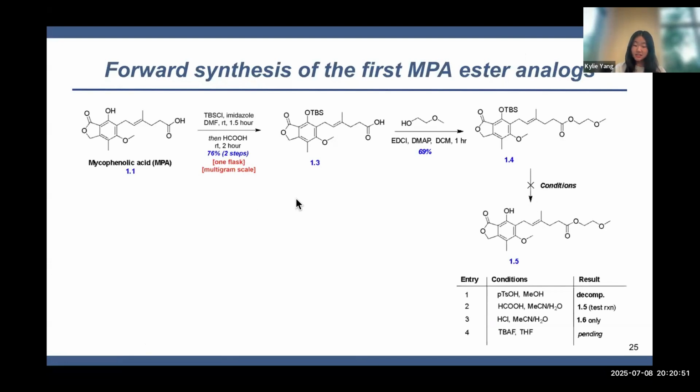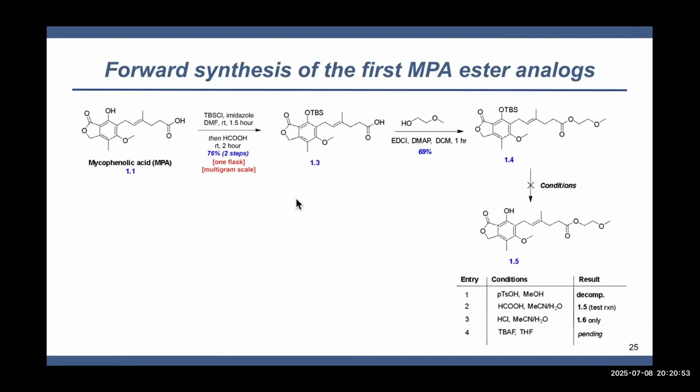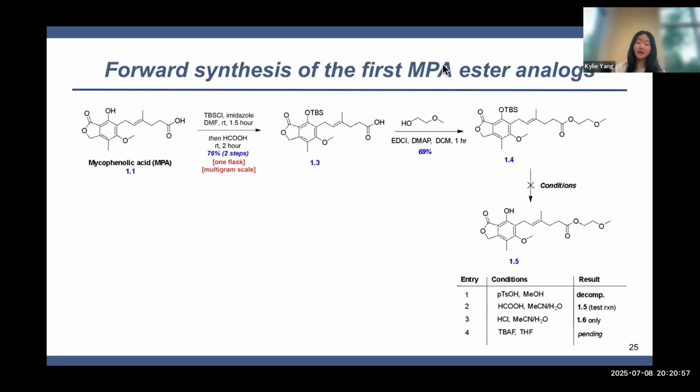However, the reaction was inefficient, requiring several hours of stirring, and we did not obtain enough product to quantify yield by NMR. And when hydrochloric acid was used, we discovered a highly polar product, as shown by TLC. We hypothesized that the strong acid had popped open the lactone ring of the molecule, as shown in structure 1.6.